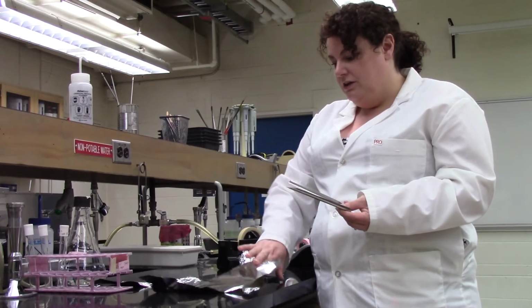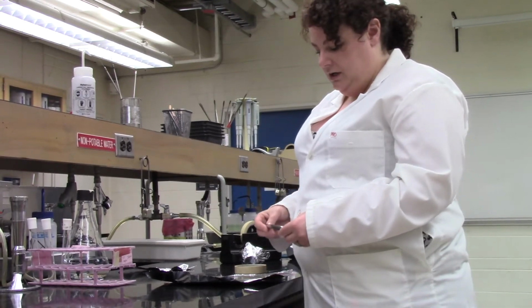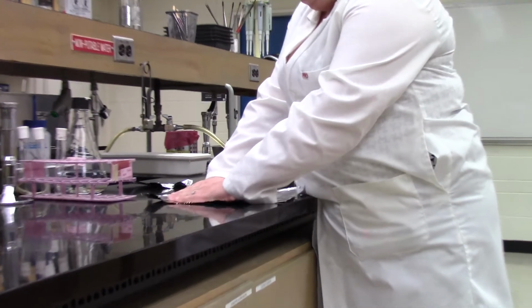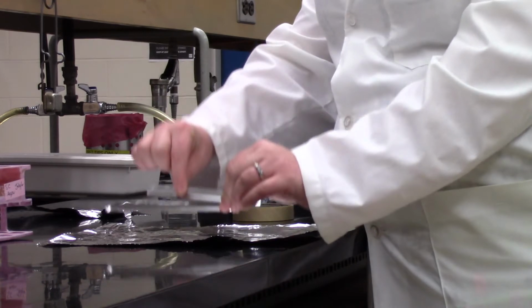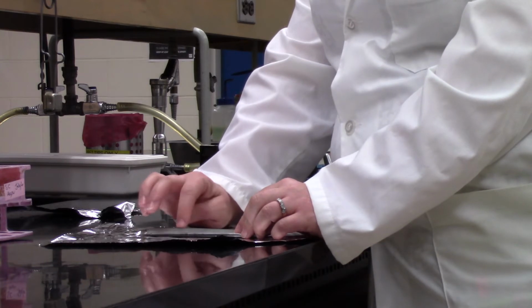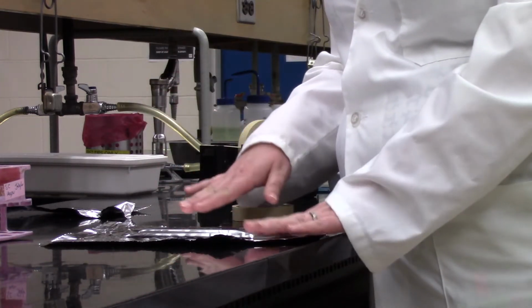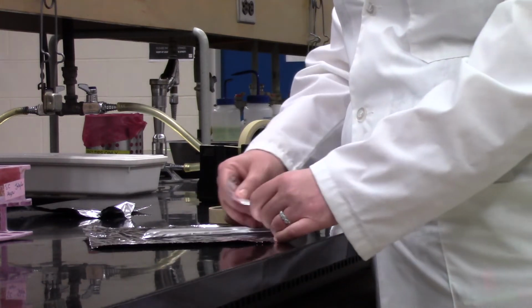So for that, I would take a bigger piece of aluminum foil. Doesn't matter if the shiny side's up or down, it doesn't make a difference. And I would just put my spatulas in here and wrap them up. Now notice that I'm putting these down side by side. I'm not stacking them into each other because we want the full surface of the spatula to get that heat and make sure that it all becomes sterilized evenly. So I would just put my spatulas side by side like this. I fold them into a nice little packet.